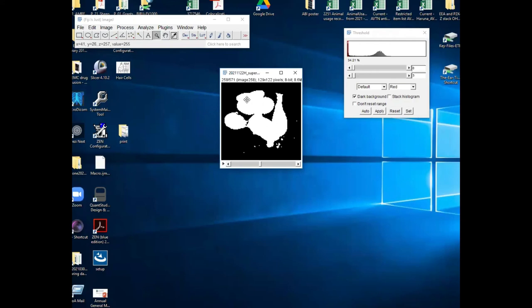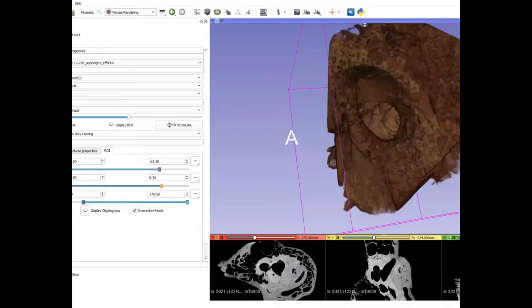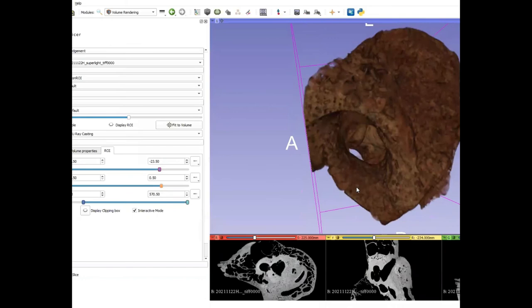So that's the first one that's in there. And I think I also put the sheep cochlea, and that's just the cochlea without the ear canal. But I think this one is probably easier in the initial instance to look at, just so that you can learn a little bit more about what you're dealing with.